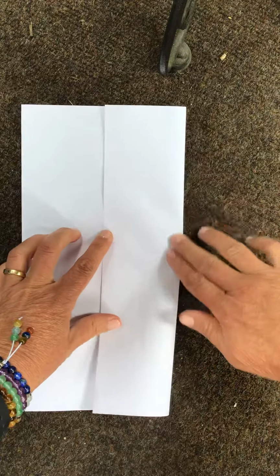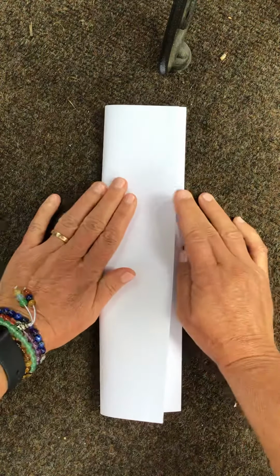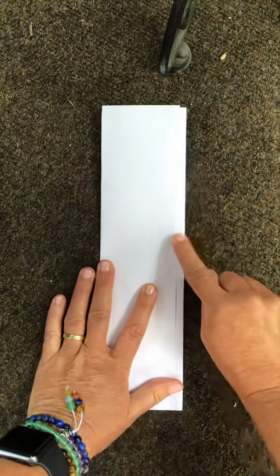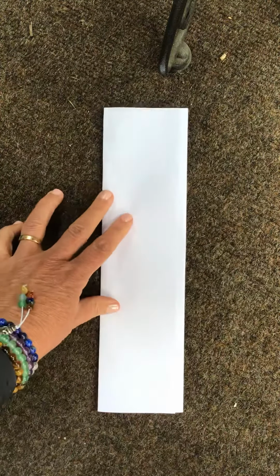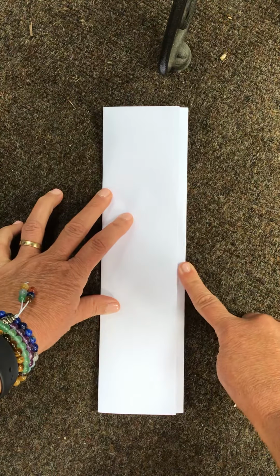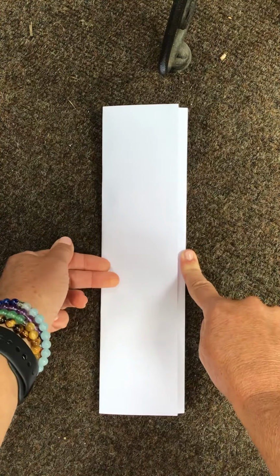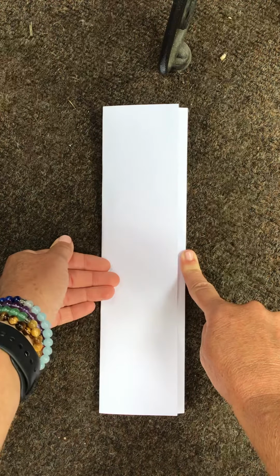And I do this all the time, every semester, and I'm not the best at getting everything even. As you can see, I don't have some overlap there. But you're gonna fold it, I guess, maybe you call this hot dog style. So you're gonna fold it over like this, and now the piece of paper is sealed on the right hand side and the left hand side, so no trace evidence can escape the sides.